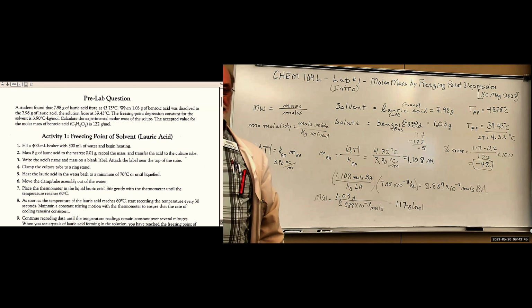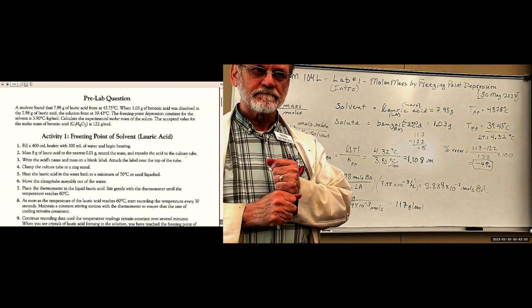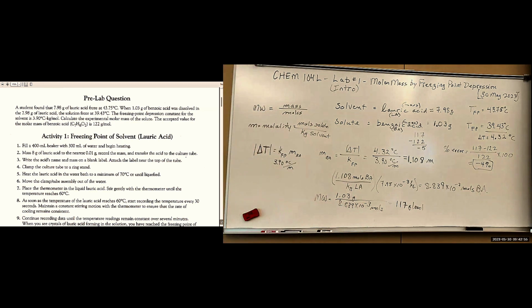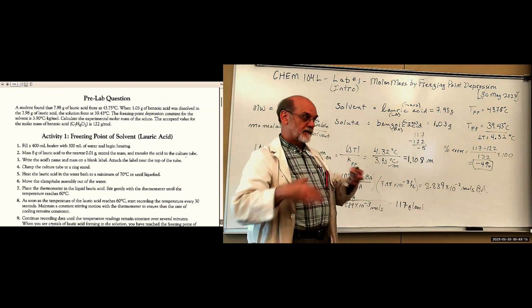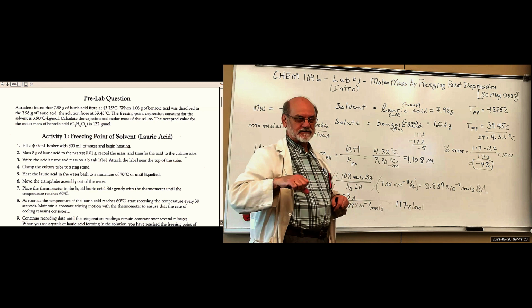Okay. In our lab, will we be discarding the solution or saving it? Does it tell you what to do? Oh, okay. Let me see. What's it say? Right, we're going to discard. So, once you get finished with that tube and the mixture, reheat it and pour it into a plastic weigh boat.